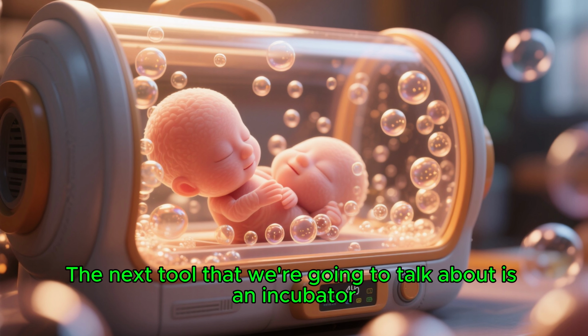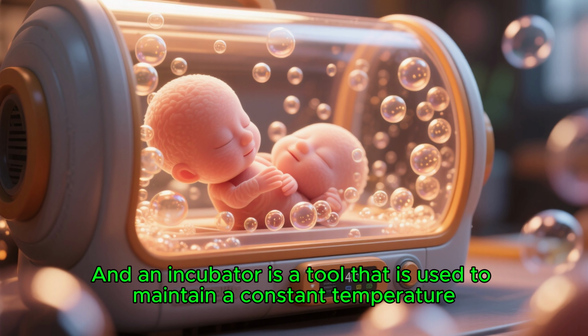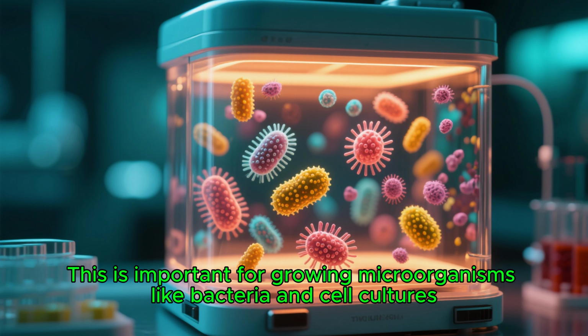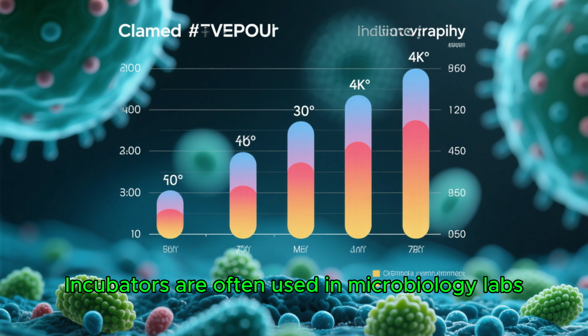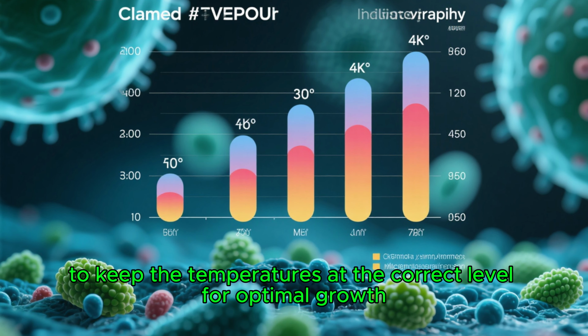The next tool that we're going to talk about is an incubator. And an incubator is a tool that is used to maintain a constant temperature. This is important for growing microorganisms like bacteria and cell cultures. Incubators are often used in microbiology labs to keep the temperatures at the correct level for optimal growth.